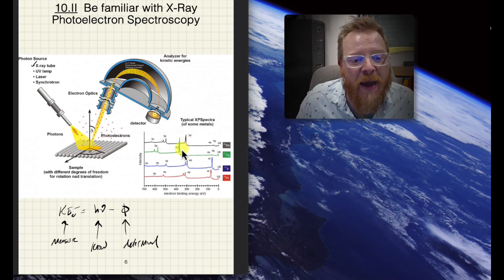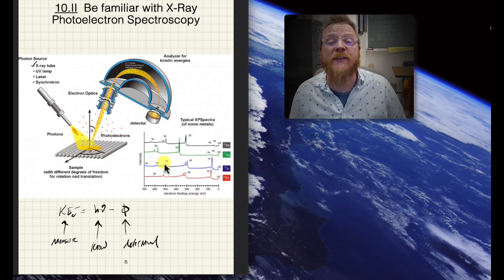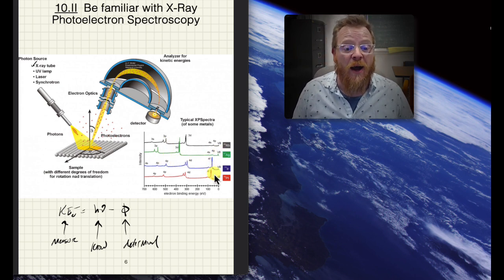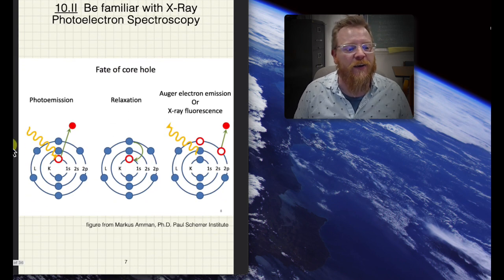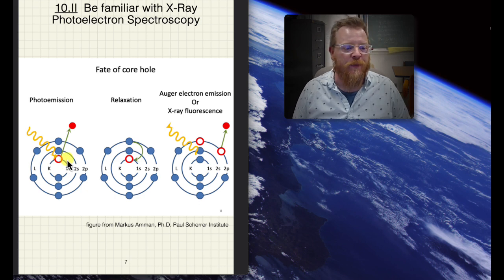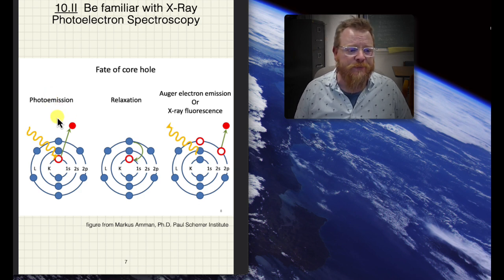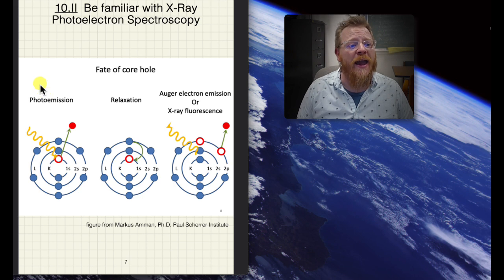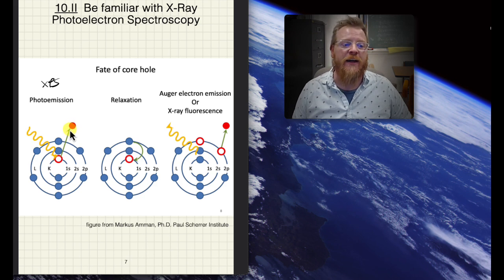So here are some XPS spectra of various metals, and you can see we get peaks corresponding to different orbital levels where those electrons were ejected from. So that is pretty cool. Let's take a look here at a diagram so we can see these dynamics. When we knock out an electron, we call that photoemission or photoionization. This would be our main XPS mechanism. So we're measuring the kinetic energy of that electron.